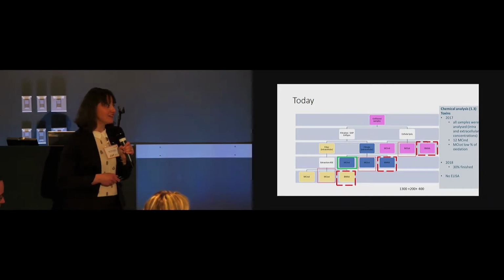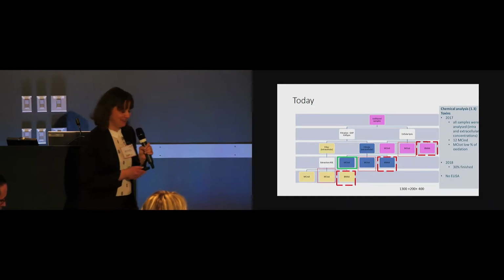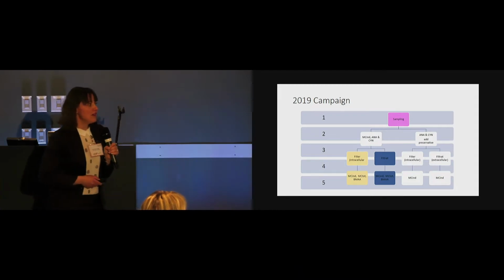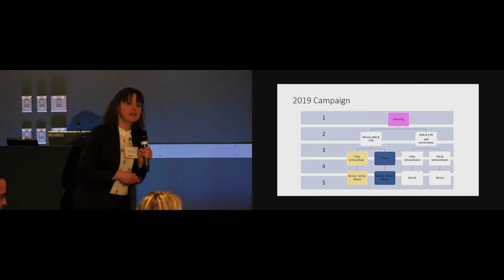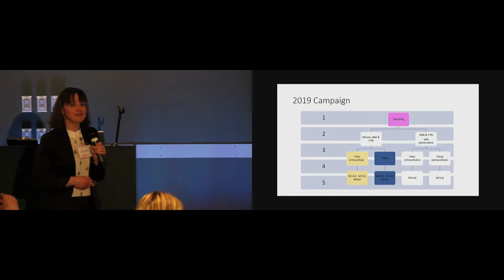I hope if everything goes fine. So now, one thing I'd like to change for the campaign for 2019, and I'd like to mention, is that at the end of 2017, the EPA came out with a new protocol for analysis of anatoxin and cylindrospermopsin, and thanks to Barry, because Barry was the one who said, "Hey Dana, did you see the new protocol from EPA?" I'm like, no.